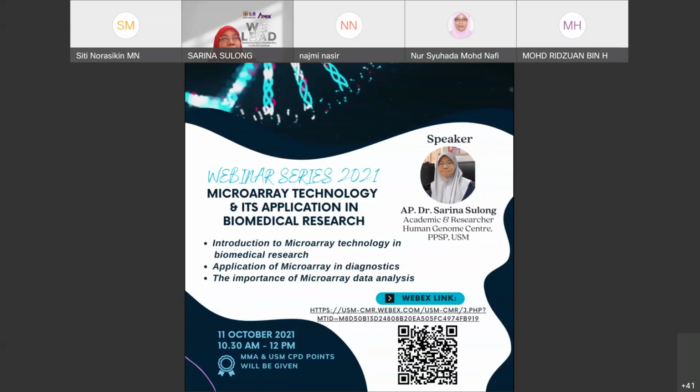And another limitation, for me, is the data analysis itself, because it's quite challenging for us to analyze it by ourselves, since we need bioinformaticians. I could say, as a last word, that bioinformatics is very important in doing this microarray and also NGS. All right.